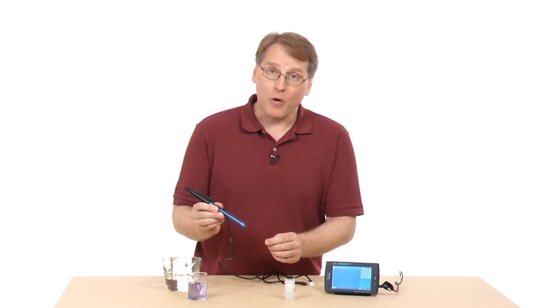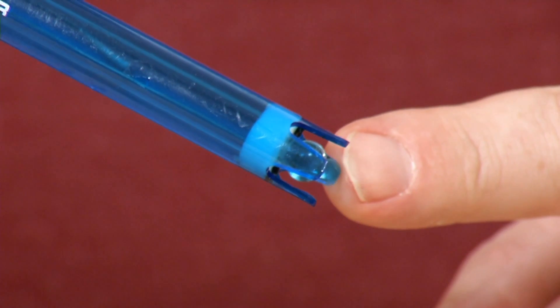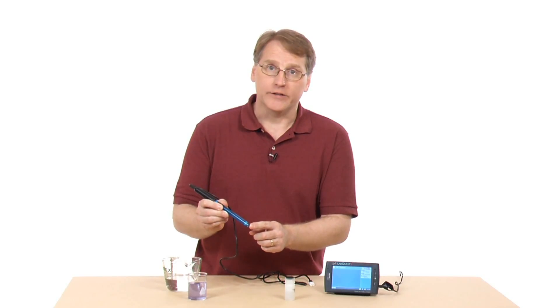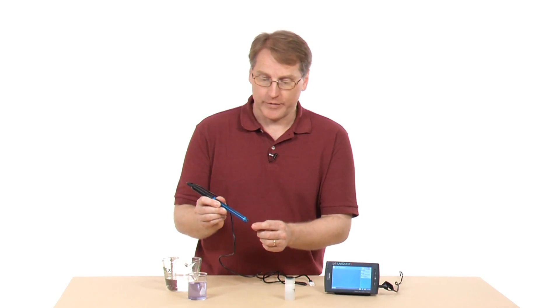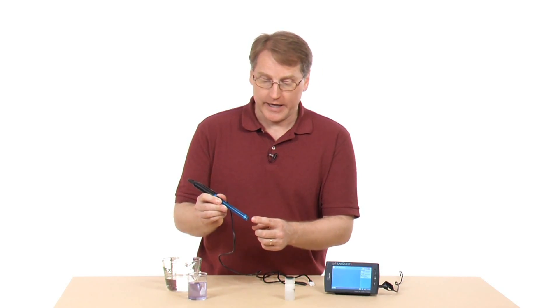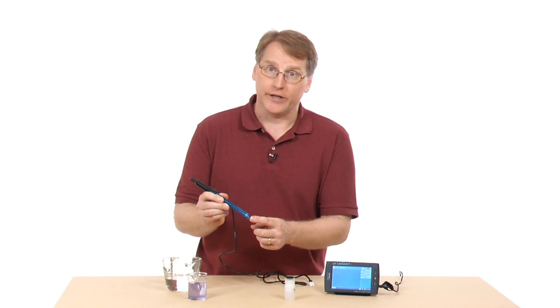Now the active part of this sensor is this glass globe down here, and that must be in contact with the solution that you're trying to measure the pH of. You need to be careful with this because it's glass, and it actually has a protective cage around there.